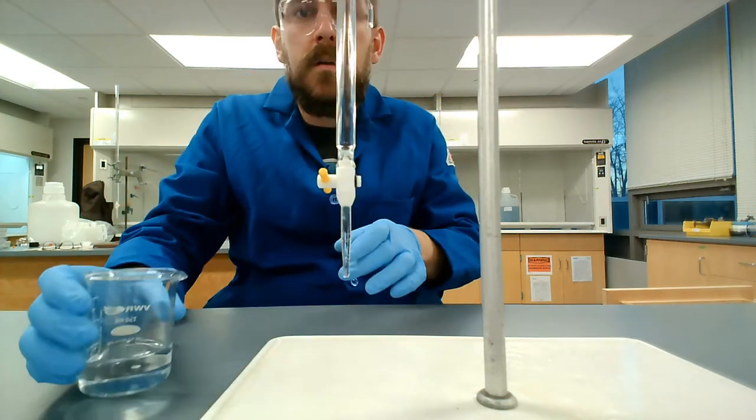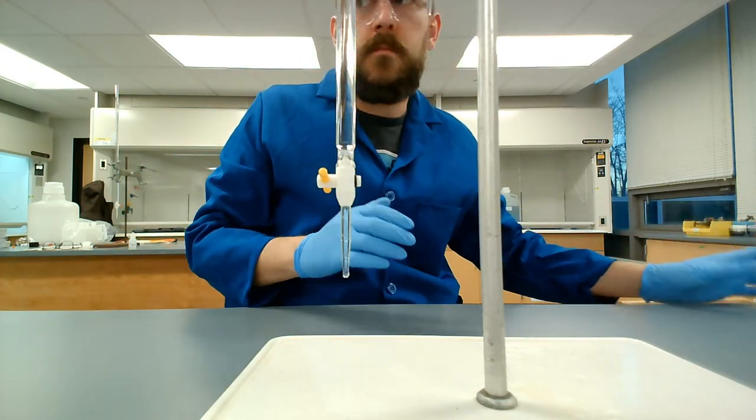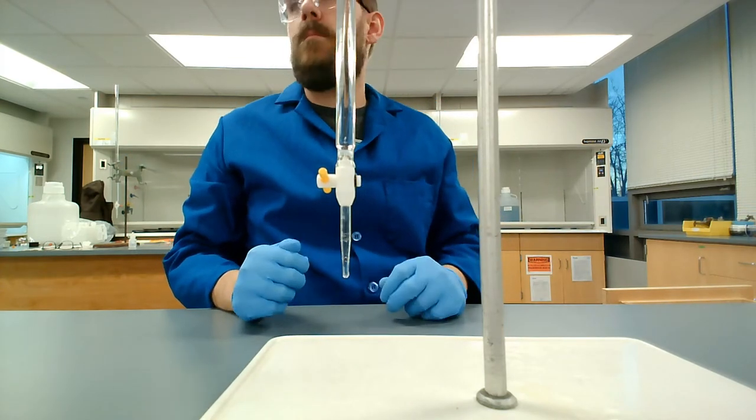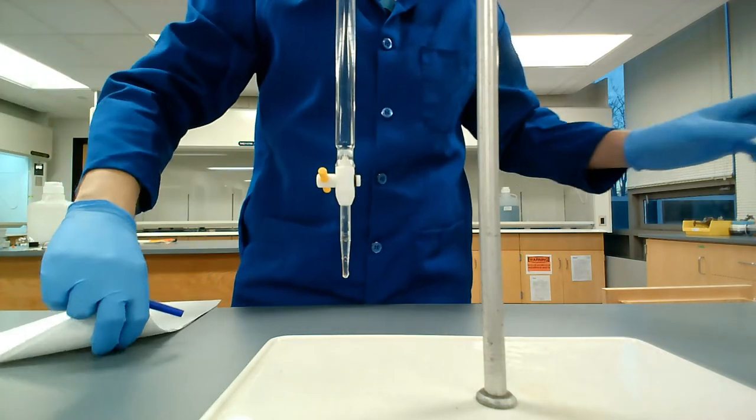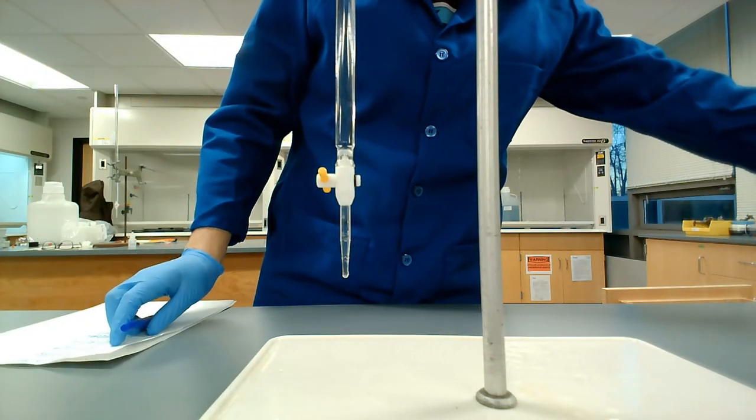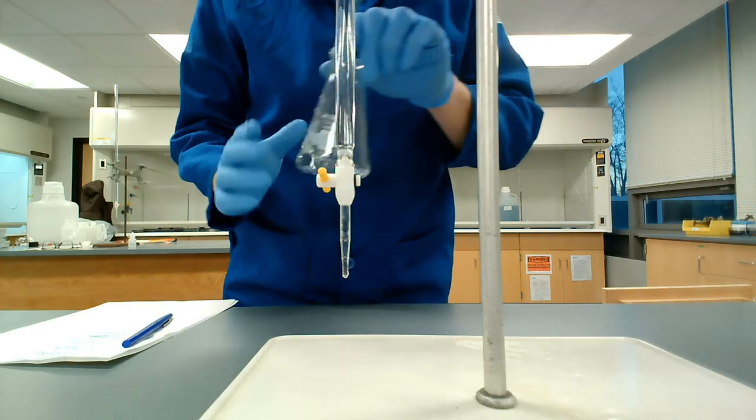I'm now rinsing or tapping the tip of the buret to this glass to make sure there isn't an extra little drop hanging on the end of the buret. I'm grabbing my sheet of paper here so I can record my volume measurements.